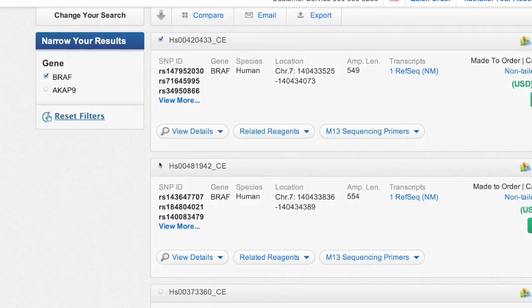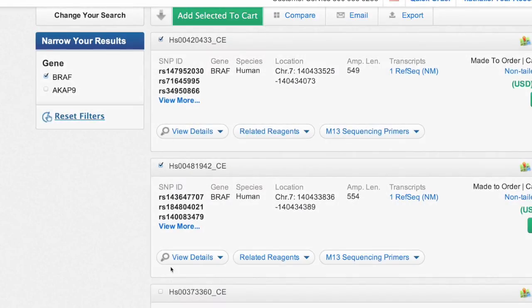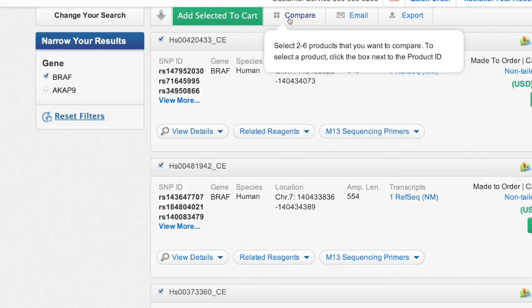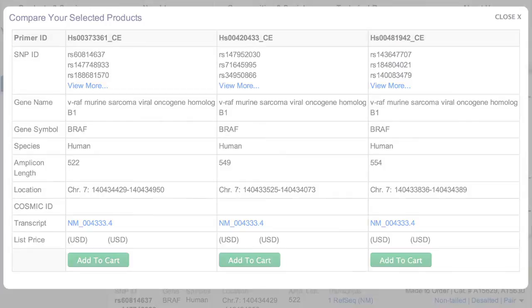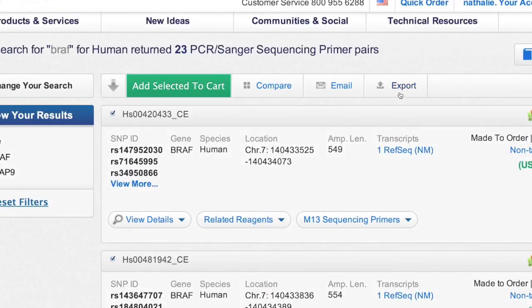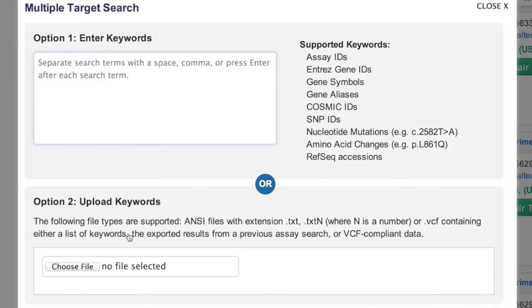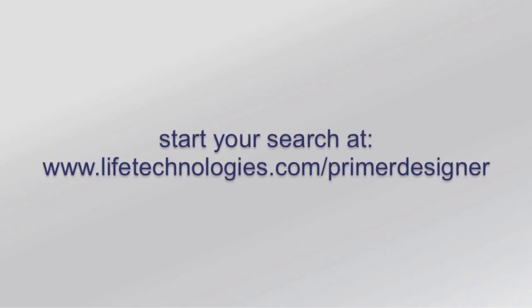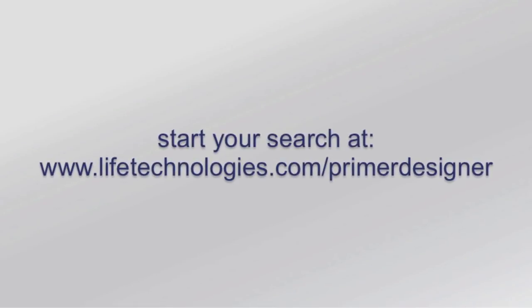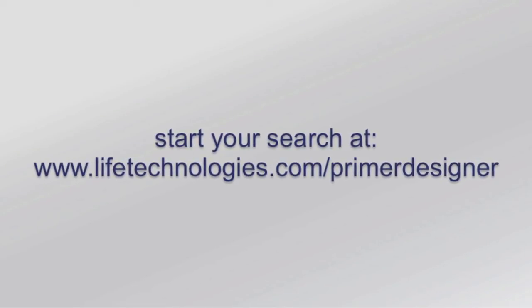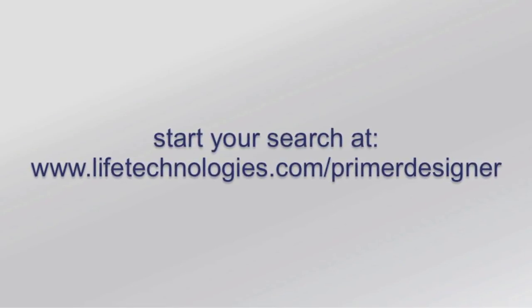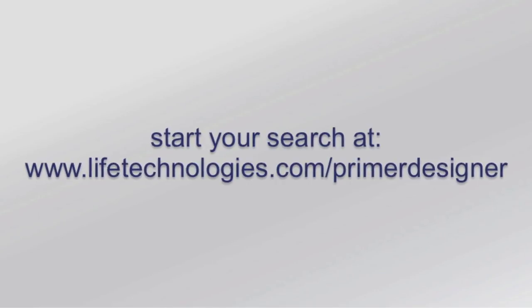Comparing primer pairs is also easy. Just select the primer pairs of interest and click Compare. You can also export the selected primer pairs in an Excel format, and later re-import them using the Multiple Target Search option. Begin your search for free at www.lifetechnologies.com/primerdesigner.